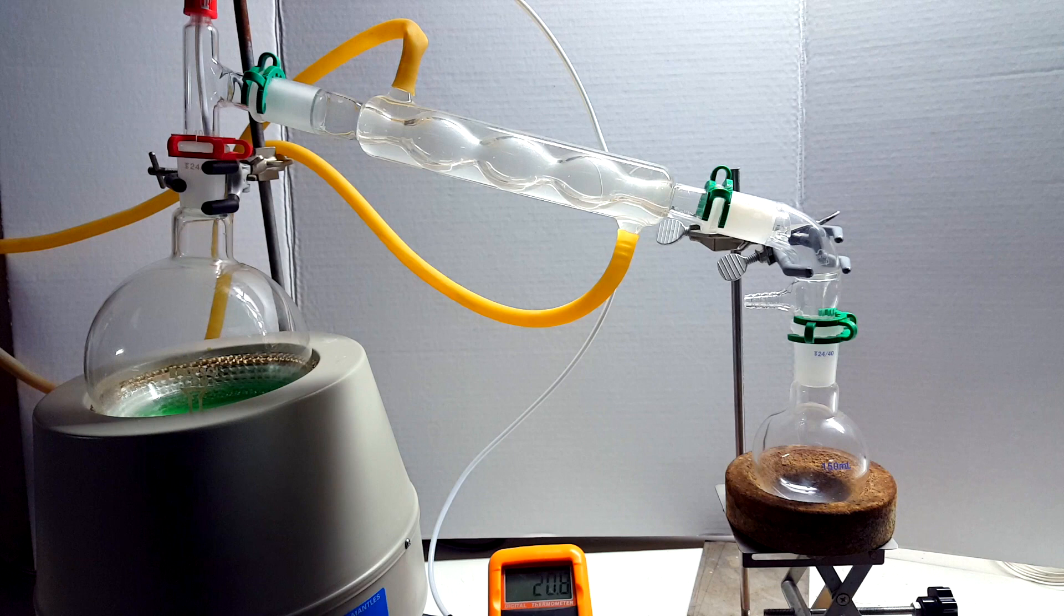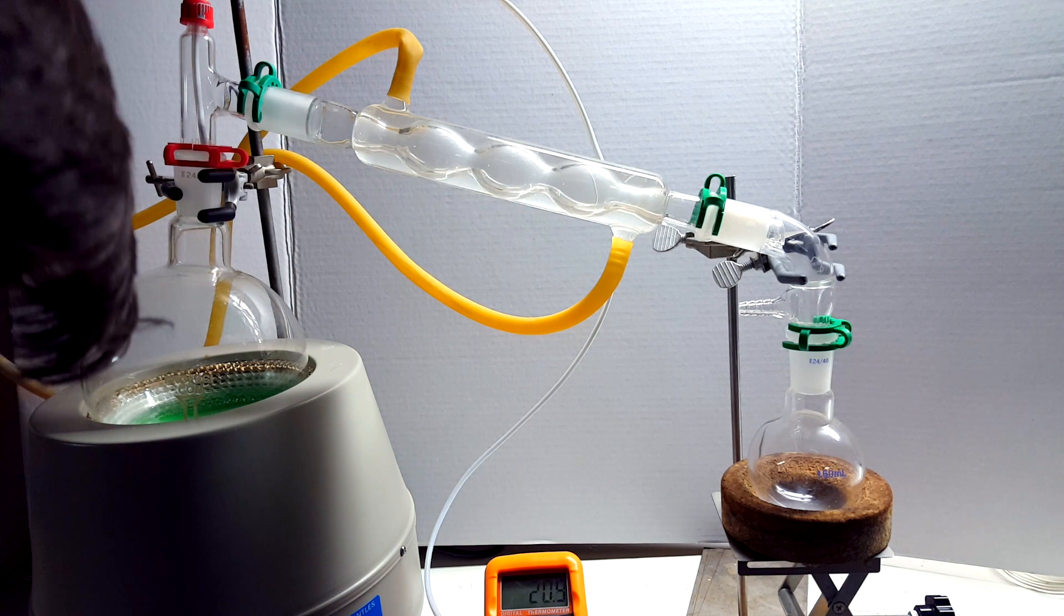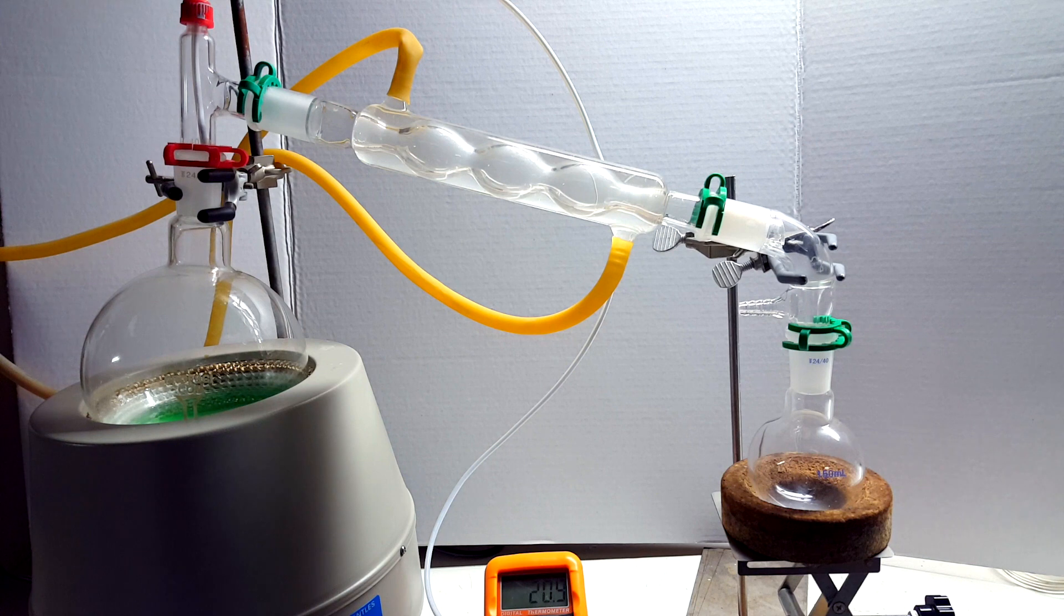Again, I set up for a simple distillation. In this case, I opted to use a bubble condenser instead of the typical Liebig condenser. The bubble condenser has a more efficient cooling of vapor from the increased surface area of the bubbles. To get things started, I turned on the heat and just stepped away.